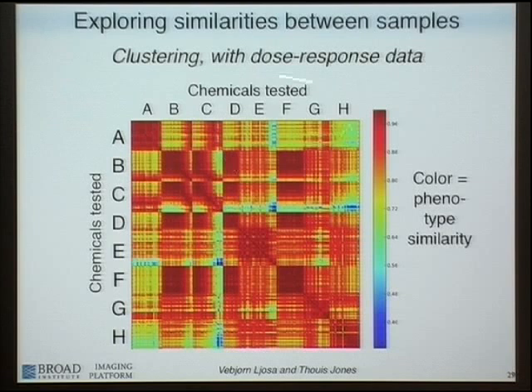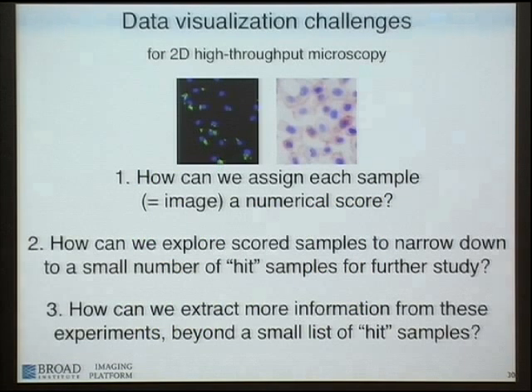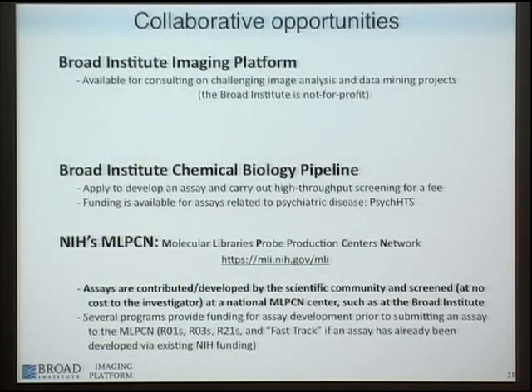This just shows, again, just clustering. Here we have dose response data, so you can see whether the phenotype is increasing across doses, and how that phenotype compares with other phenotypes that are seen in a set, and so on. But we really don't have a lot of tools in this area, and so I'm excited to have more arising. So that's all I wanted to talk about today.